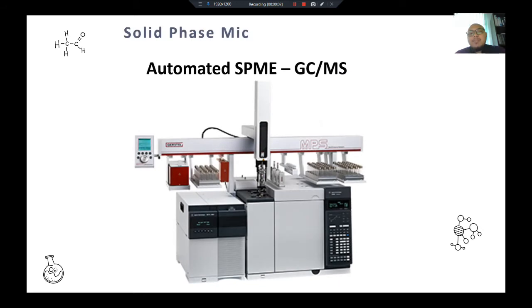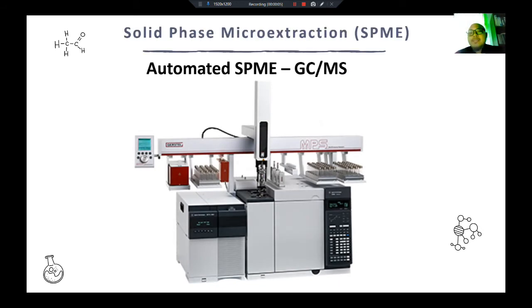Okay, SPME also can be automated. Okay, maksudnya dekat sini you boleh letak you punya syringe. Okay, macam tadi saya tunjuk tadi adalah manual punya SPME. Yang ni automated, kat sini kita boleh letak syringe dan kita boleh setting kat sini lah, automated SPME. Alright.